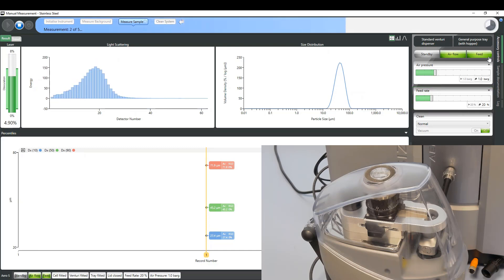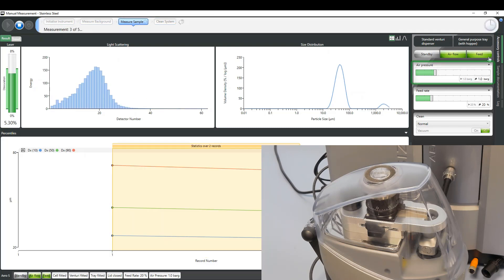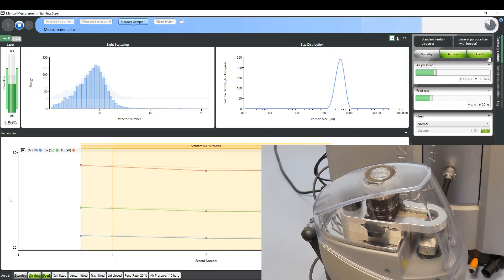Metal powders also don't tend to aggregate too robustly in dry conditions, so a low pressure, in this case 1 bar, can be used to obtain a complete dispersion. It is a good idea however to carry out a pressure titration to establish this.